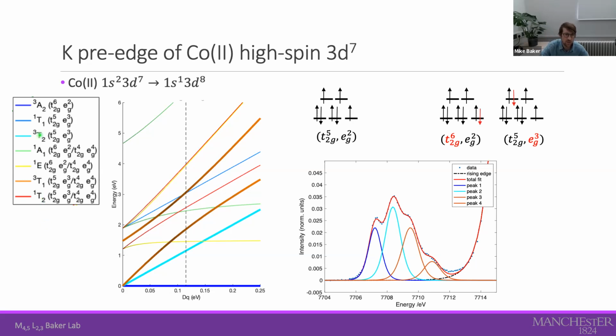It would also be useful to label, in addition to the Mulliken symmetry labels, the electron occupations. If we do that, then we can consider this cobalt ion that I showed before, where we have these four peaks, however with only two different 1s electron excitations in the orbital basis. Then we can start to understand why we do indeed have four there.